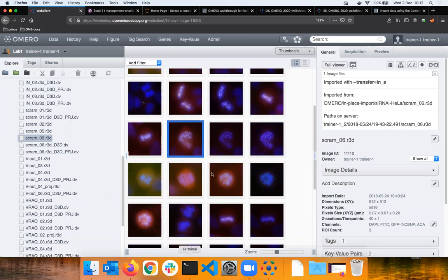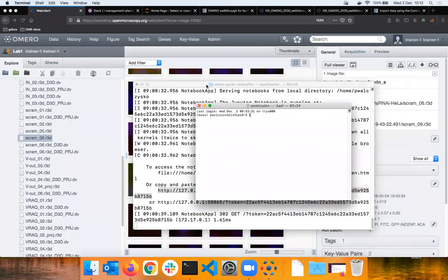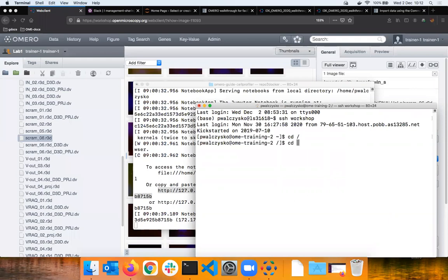I was trying to show it yesterday. They do not necessarily sit in the same physical location, as long as one can connect to the other and you know how it works, that would be fine. We probably do not need the terminal, Peter. So is it clear? Does that clarify the information a bit more?